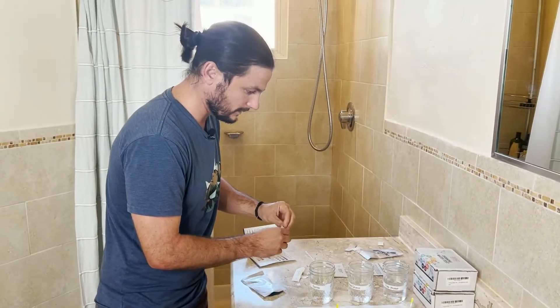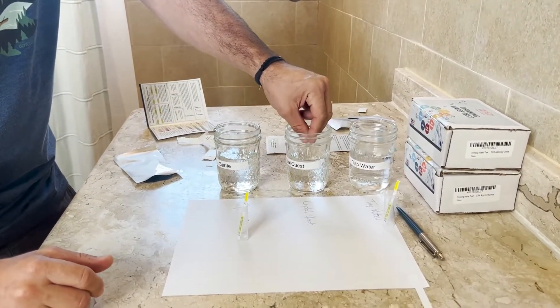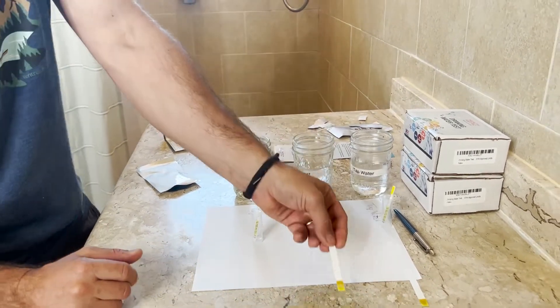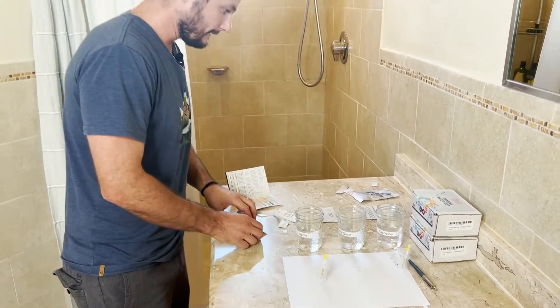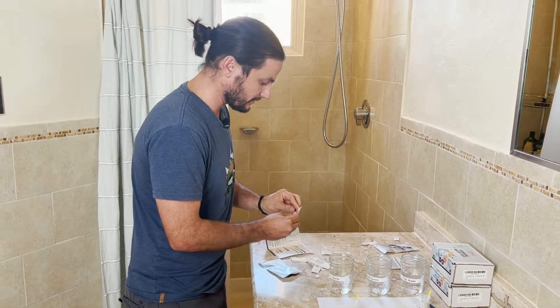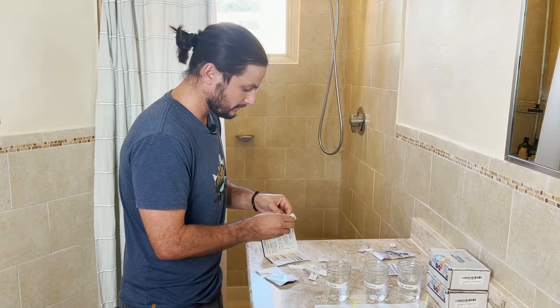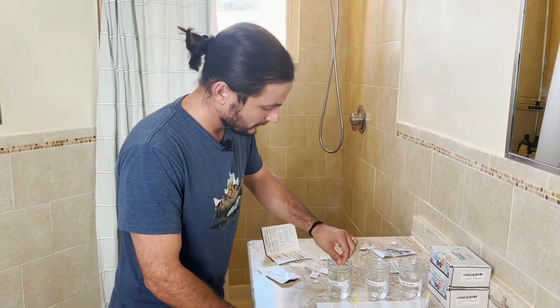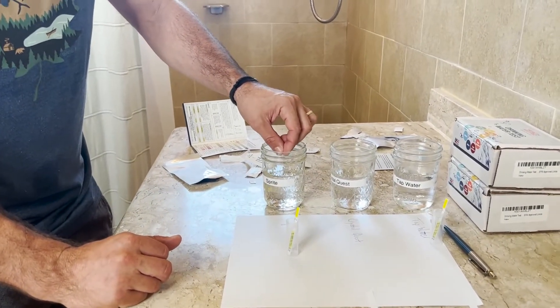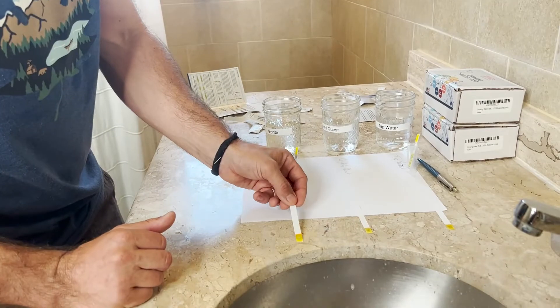Do the next one — this is the Crystal Quest. Count to about seven seconds. Okay, that's the Crystal Quest one. And then the very last one is going to be the Sprite filter.